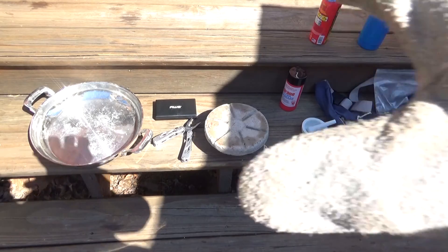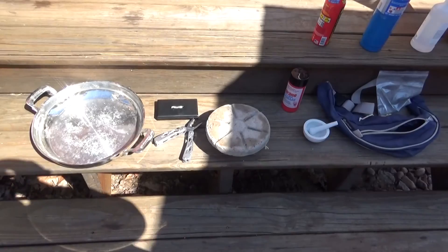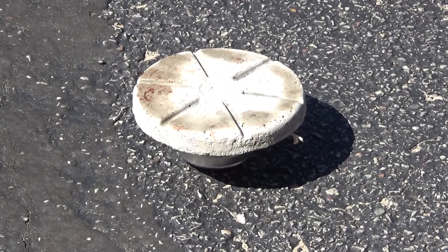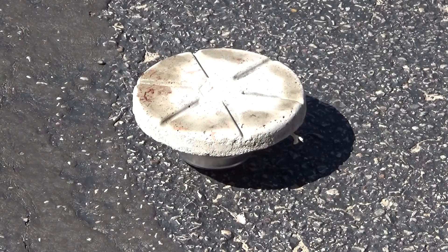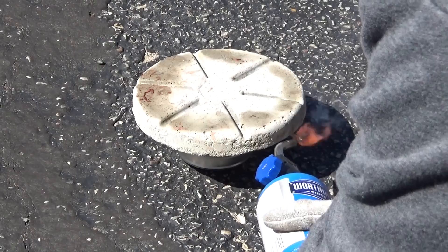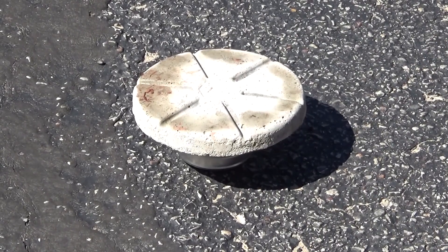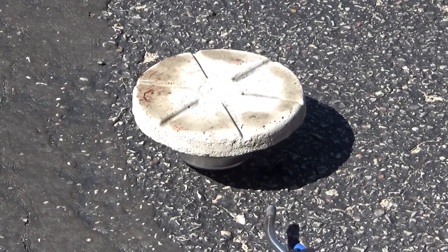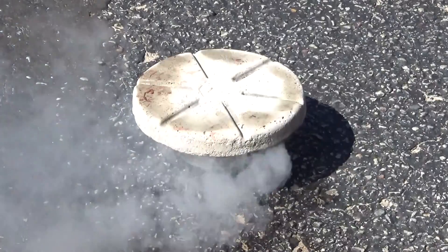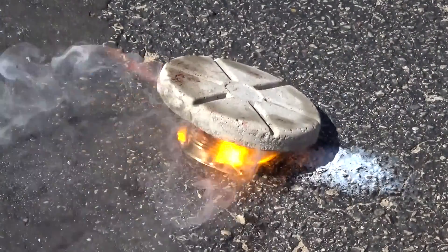I just thought I'd mention that so YouTube doesn't go haywire and start deleting all my videos. Got my torch. There we go. There it goes.